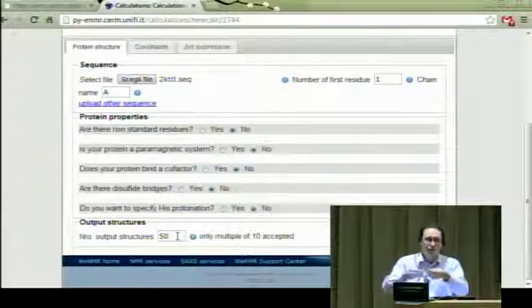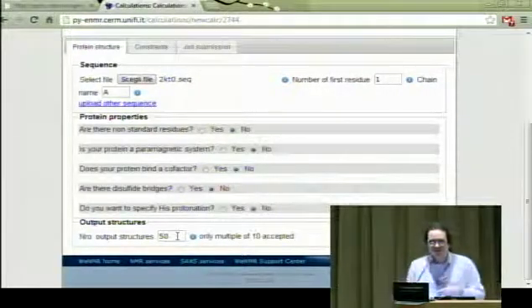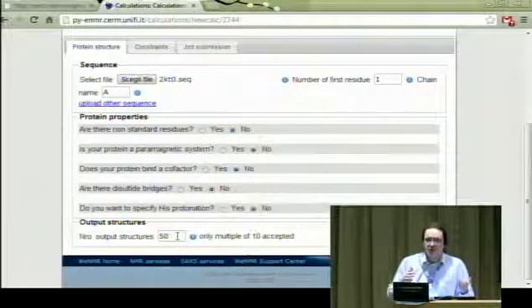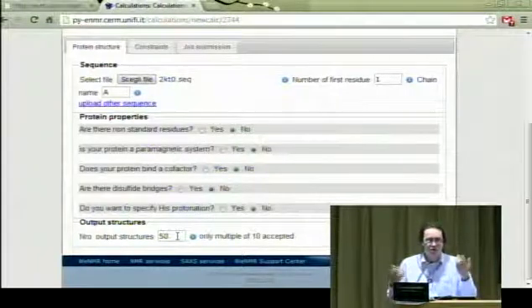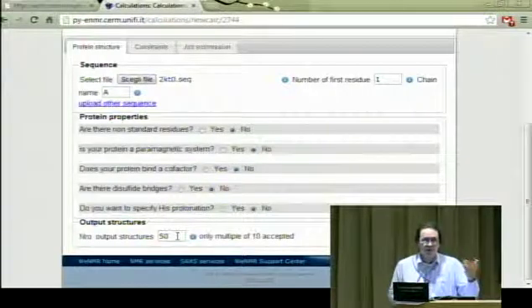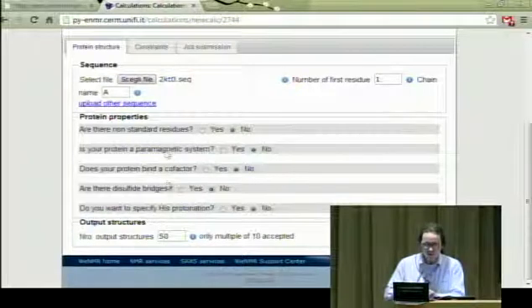At the end, you get 50 different conformations, and then typically in a post-processing step, you will only select the best, either in terms of total energy or in terms of energy of restraint violations. This is up to the user. You will select the best structures, and you can use those for the subsequent refinement.